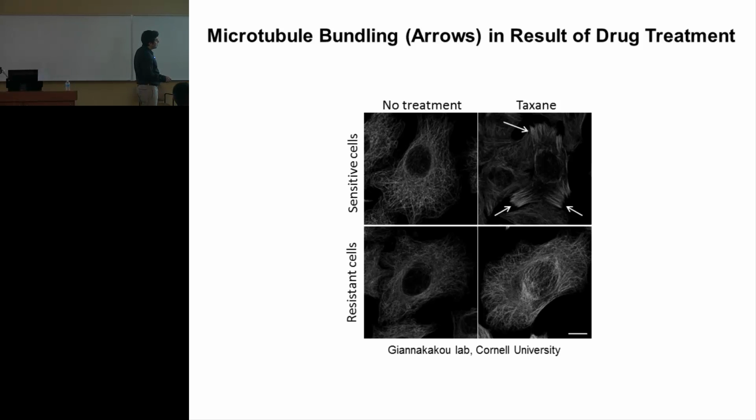You just want to say responding or not responding, or do you want to put a number to it as well? If you look at objects here, or if you do some thresholding, we can identify these fibers and see how thick they are, how long they are, how many they are, and what the intensity is compared to this, because this is like a spider net, very intricate and not very bright, and this is very different. So we can say that they are affected, but ideally we also have a number for the level to which they're affected.